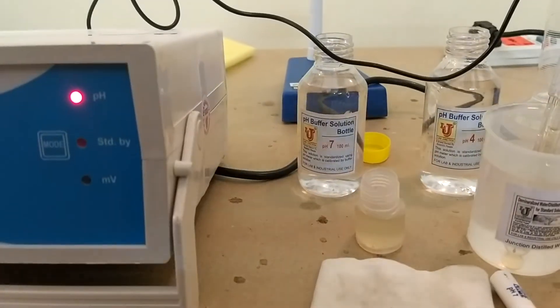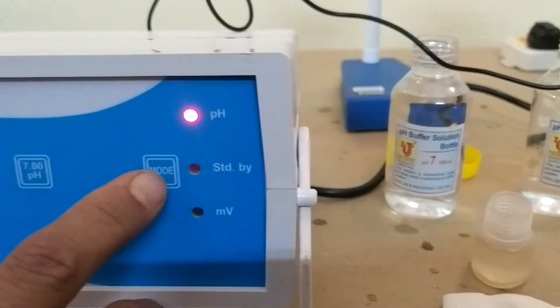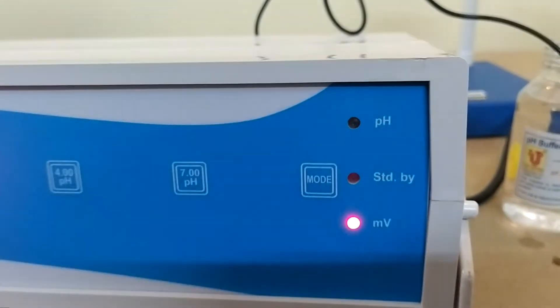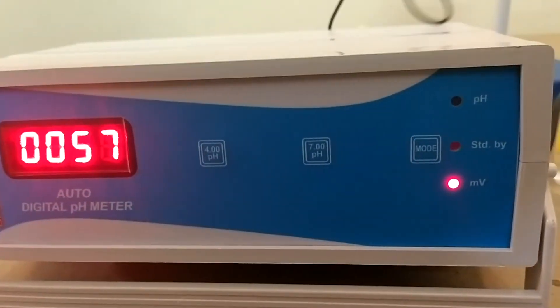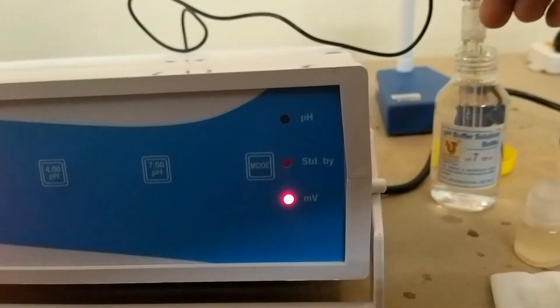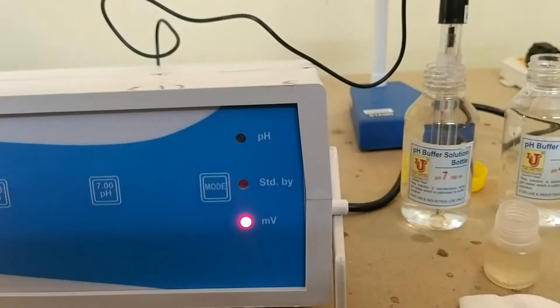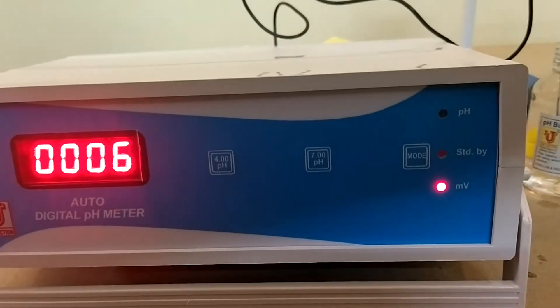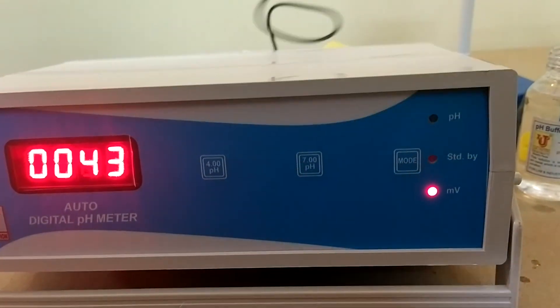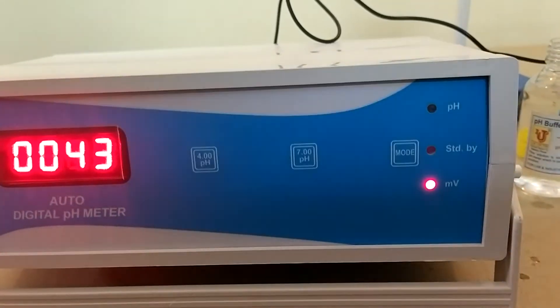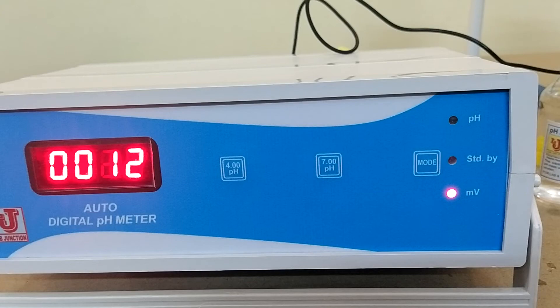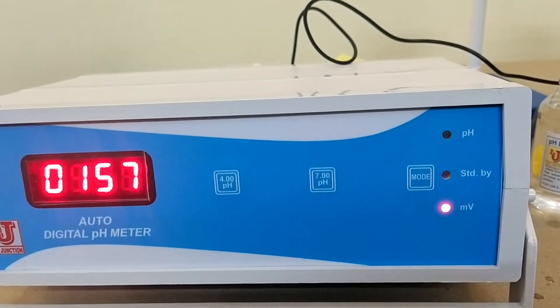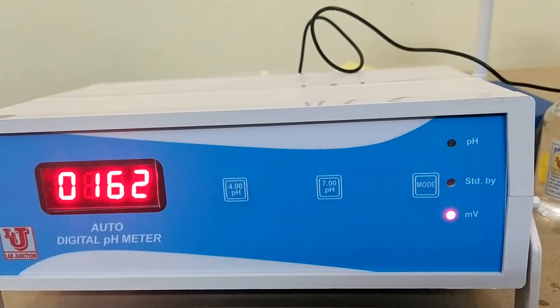If you want to do ORP, then you can do on millivolts. What are your millivolts comes on 7 pH buffer? 0. For 4, millivolts are in between of 150 to 200.